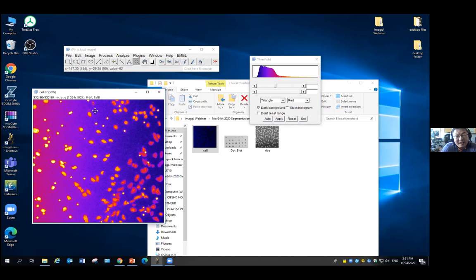Then only analyze the image under the right acquisition condition. Sometimes the unevenness is not because the microscope is set up wrong, it's just because of the sample itself. Then we'll try to use local thresholding. But for something like this, most likely your microscope setup is not right. In this case, correcting it in analysis is the last resort. You should first go back to your microscope to make sure your image is right.